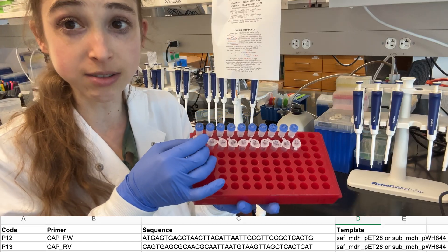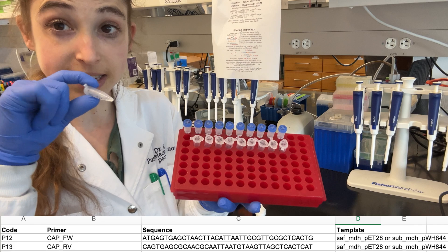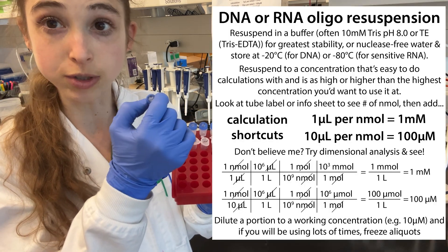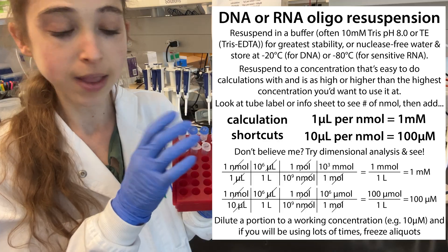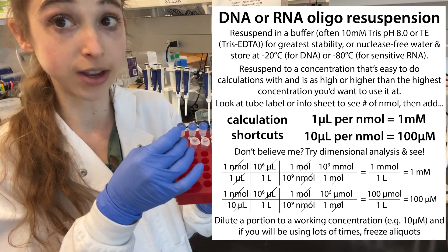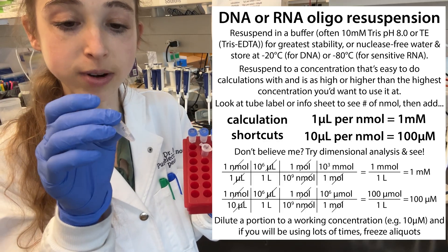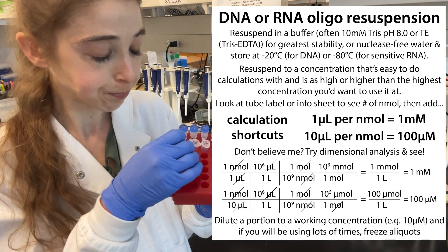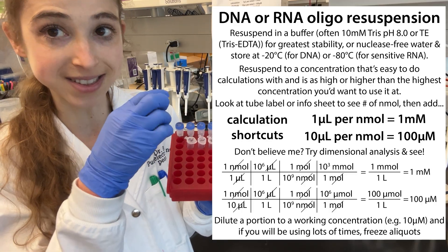I use the same cross-reference number and set up a separate tube for the dilution. I go through, look at all the tubes, figure out which is which, write the code on top, and make a separate tube with that code. On the side I also write the date, and since this one will be 10 micromolar, I write 10 micromolar on both the top and the side of the tube.